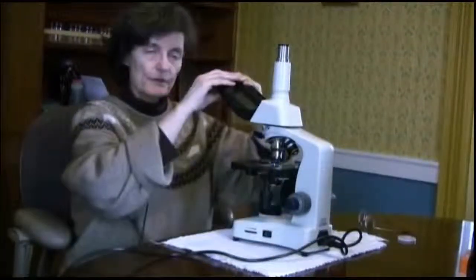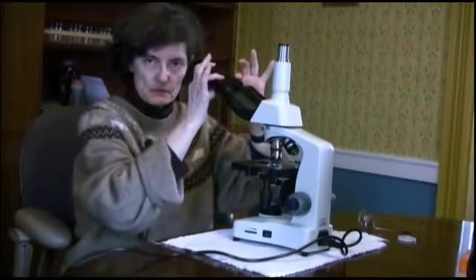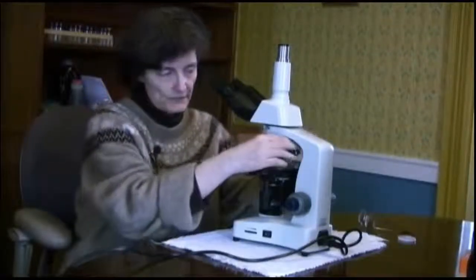The critical things to have are the binocular eyepieces — 10X wide-field eyepieces. The next thing you need to have is at least a 4X lens, a scanning lens, so you can see things at pretty low magnification. You need a 10 or 20X objective, and then a 40X objective.